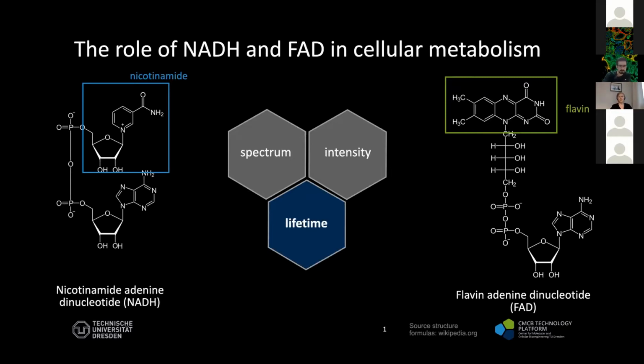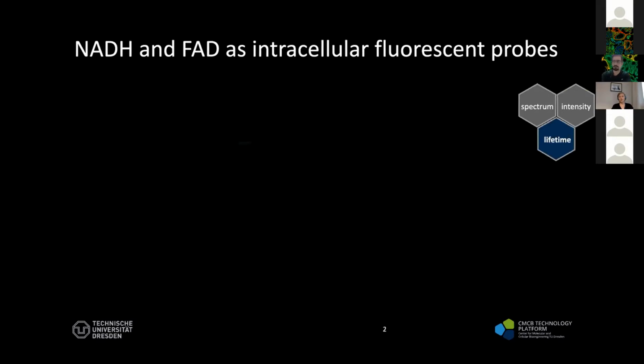And as you can imagine, since they're involved in metabolism, the obvious candidates for protein interactions are enzymes of metabolic pathways. I will now give you a short overview of how this intrinsic fluorescence and its lifetime is being used, and how this can be interpreted in the biological context.